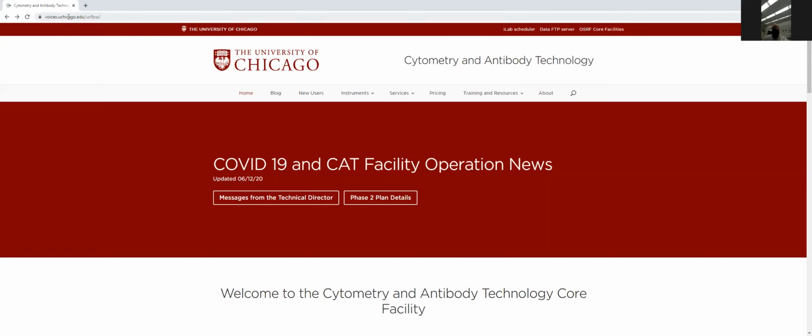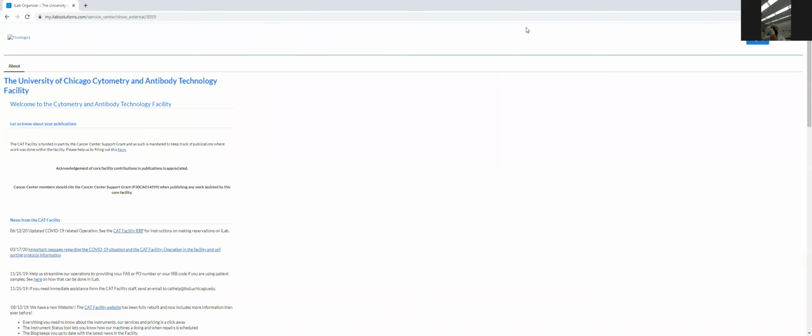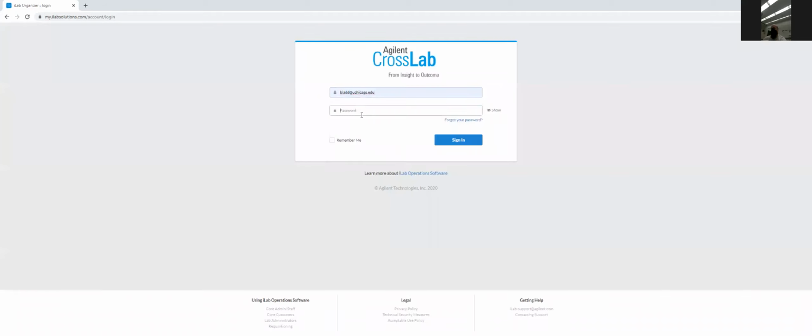If you've been having issues with the new scheduler and typically navigate to iLab via your own bookmark, instead try coming to our website, voices.uchicago.edu/UCFlow, and go to our iLab link here. Sign in if you're not already. I'll do that for myself. No peeking, please.